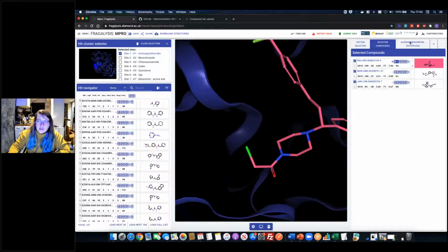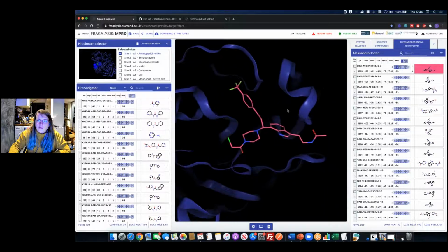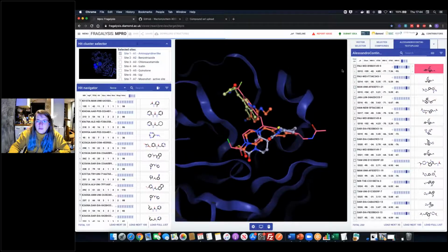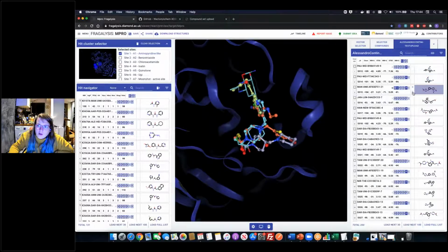Another feature that exists over here to try and help you navigate quickly through the ligands when you're looking at them. So if you had a view of different inspiration molecules that you were looking at and you were comparing, for example, so let's turn some on, and you wanted to look at other molecules that might be interacting in a similar place, you can just click on these down arrows and it'll very quickly navigate through all of the ligands for you, applying the same settings.